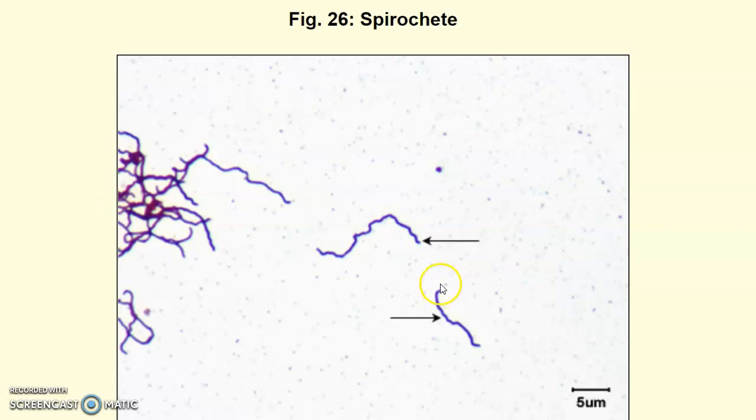The spirochetes tend to almost corkscrew or spiral their way into tissues or through the skin. And so the spirochetes are going to take on a little bit different appearance than you noticed from the spirillum bacteria. So just use that one circle to draw both your spirillum and your spirochete.